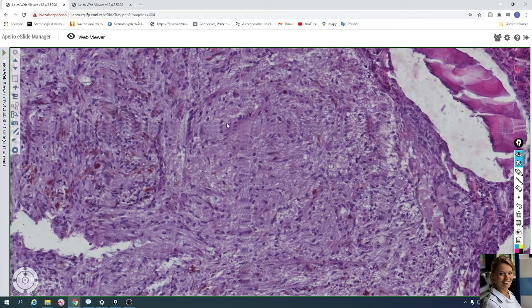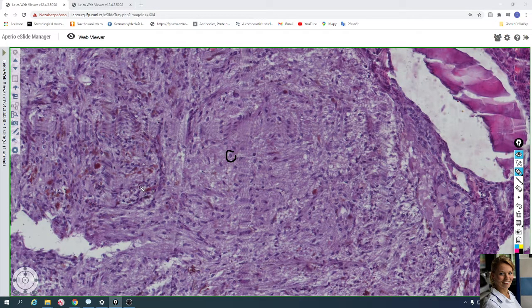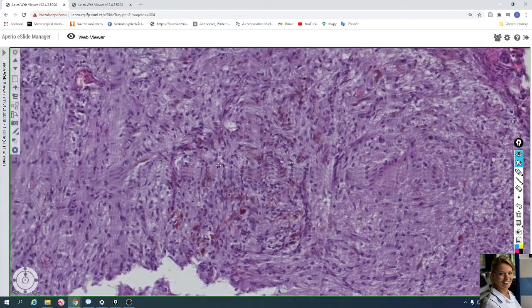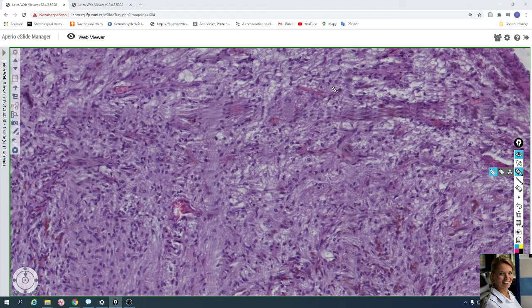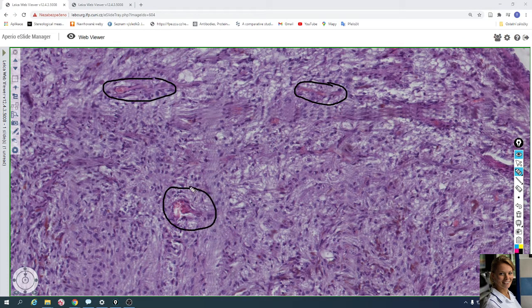Here is the posterior lobe with nuclei of pituicytes. The pituicytes sometimes contain brown pigment granules in their cytoplasm. Of course, you can find many capillaries — for example here are capillaries with erythrocytes in their lumen.